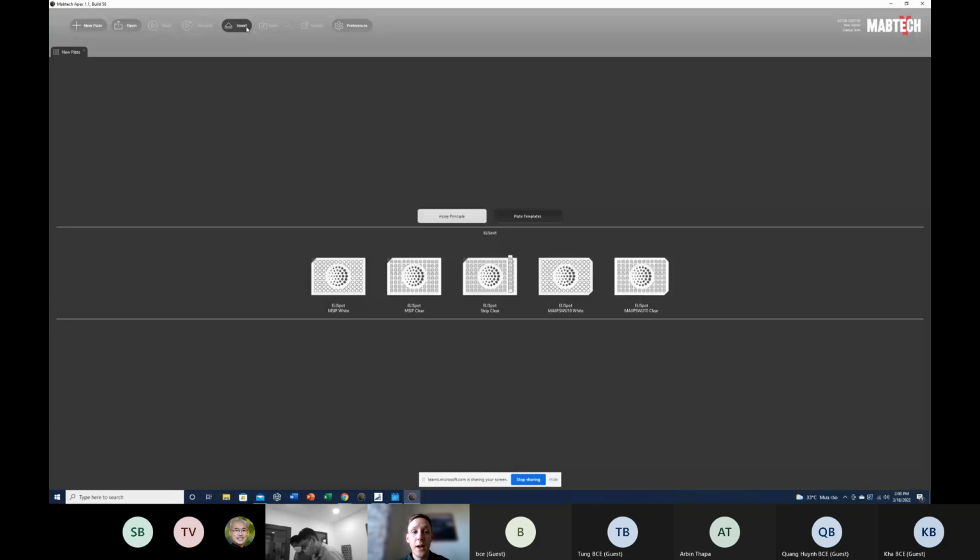Okay. And then when it's been removed, it's like a metal hatch that you pull down. And then you're inserting the plate, and it's important that the top left corner of the plate is going into the top left corner of the plate holder. So the top left corner of the plate is A1. And that corner is going into the top left plate holder.